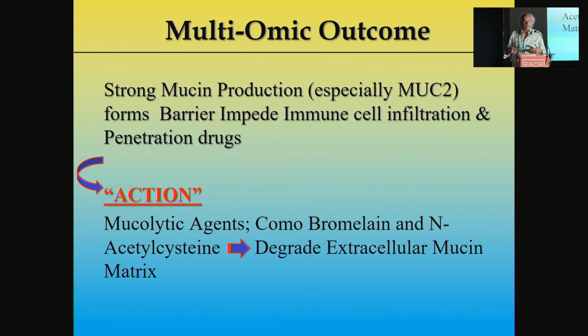So anyhow, we came to a conclusion where we could address this, and we found a combination of treatment of how you can solubilize these glycoprotein barriers. They can be small, they can be mid-sized, and they can be really large, so they aggregate.